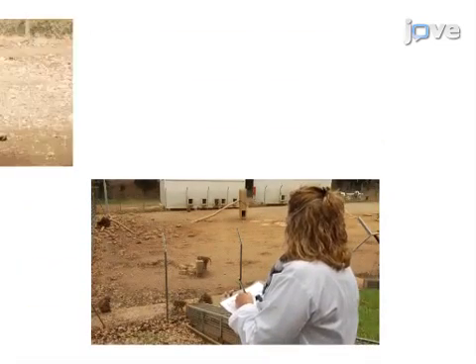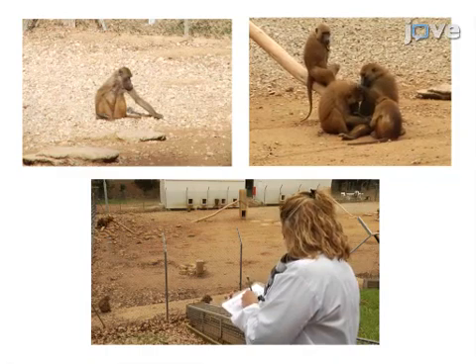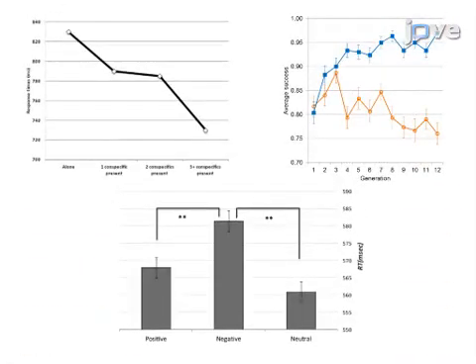Adaptable protocols can inform the experimenter on the effect of the social mood on performance, social influences during cognitive testing, and the cultural evolution of the behavior in transmission chains. The results validate the use of ALDM to study social cognition in non-human primates.